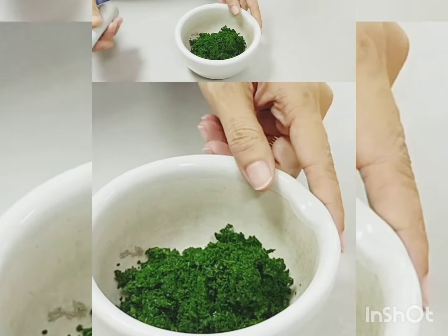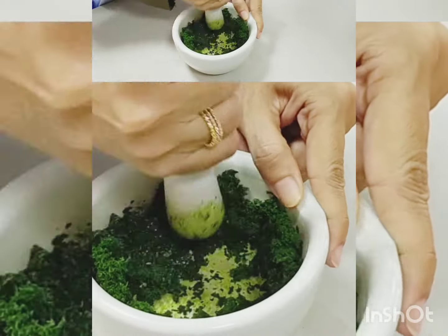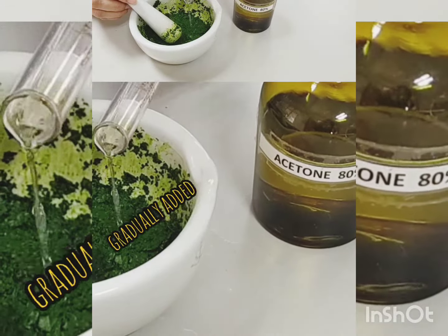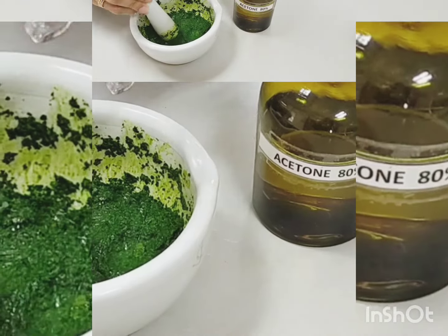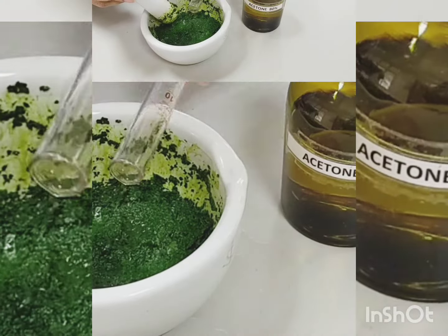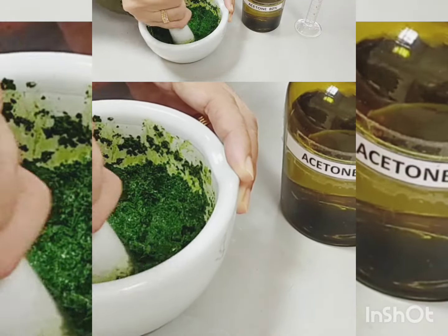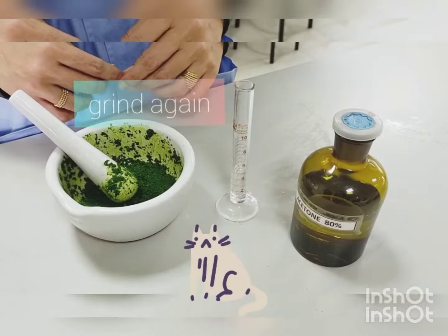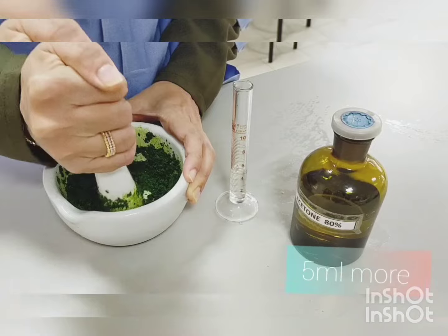Using the pestle, grind the leaves. Add 5 ml of acetone gradually into your grind leaves. Now, leave them for 10 minutes. Grind again and add another 5 ml of acetone.